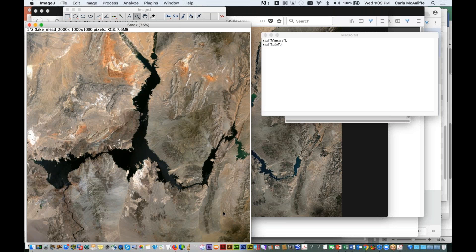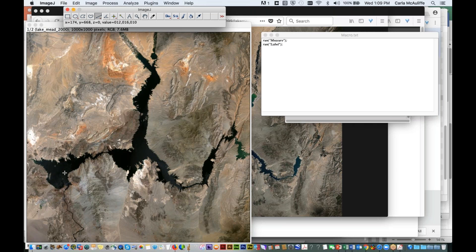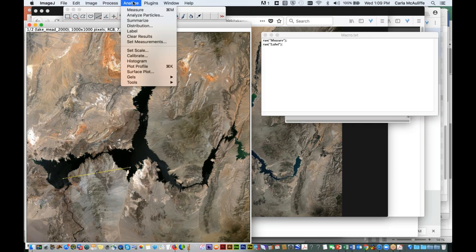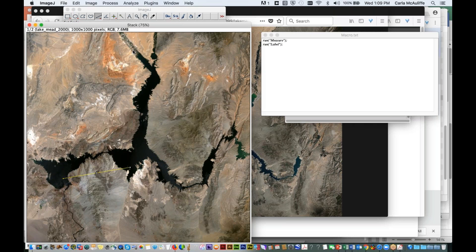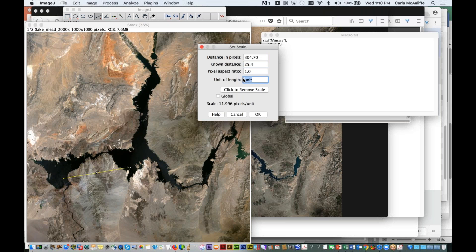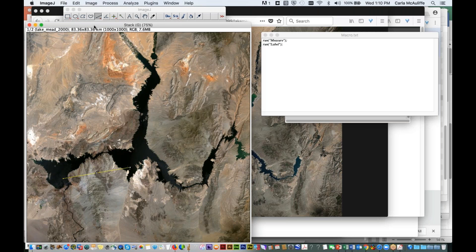So to do that, I need to set a scale for this image. Or you can get an image that already has a scale in it. But in this particular case, I do know the known distance between these islands here. So I can set a scale using that distance. And we're going to set a scale. And I know that that distance is 25.4 kilometers. And I'm going to change the unit to kilometers. And I'm going to say OK. And now you can see that my image is given up here as 83.36 square kilometers.